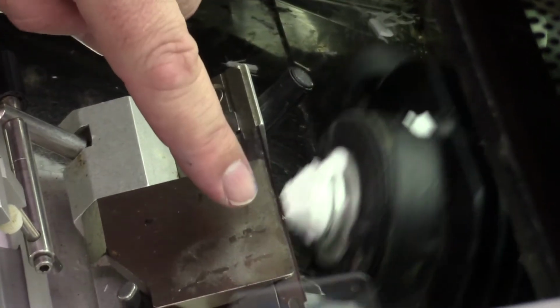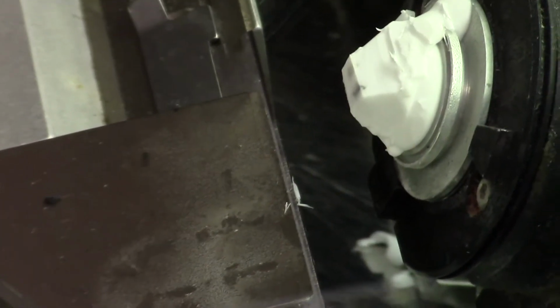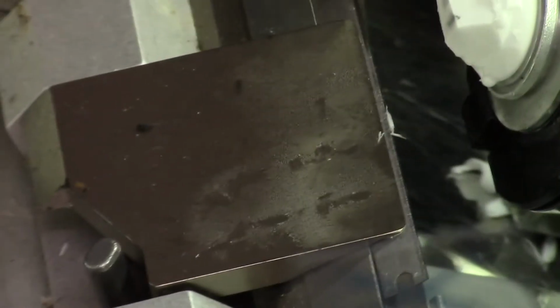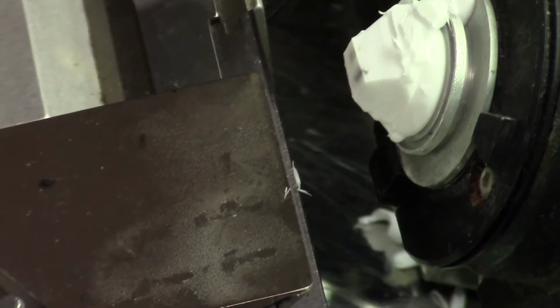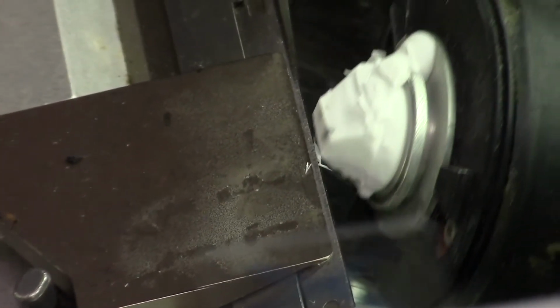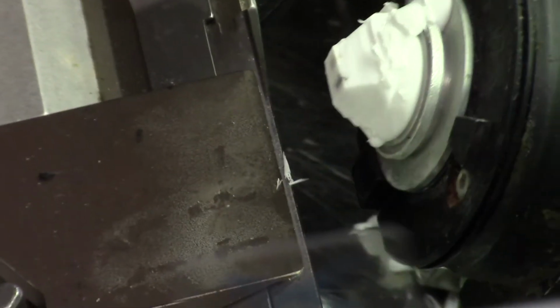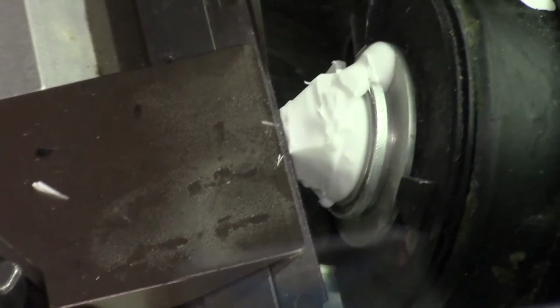Oh, do you see the first snowflakes? Every time I turn the crank, this is moving forward towards me by 20 microns. And this right side of the block happens to be sticking a tiny bit taller, not enough that I could see it with my eyes, but enough that the knife is cutting the right side of the block without touching the left side. Now I've gone through enough times that it's cutting the whole block.